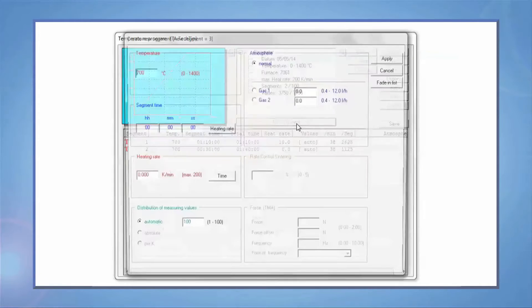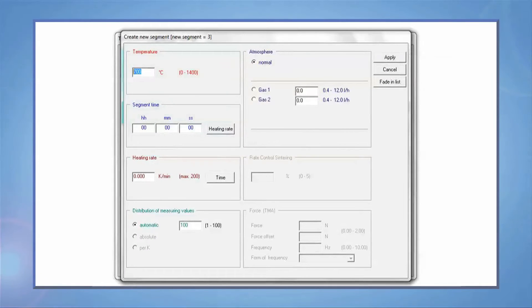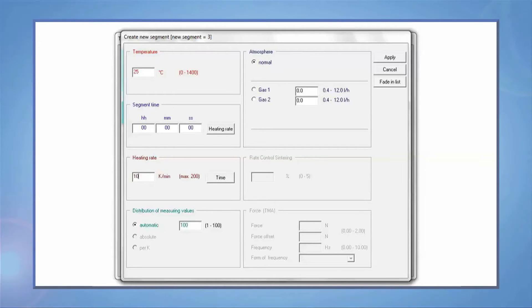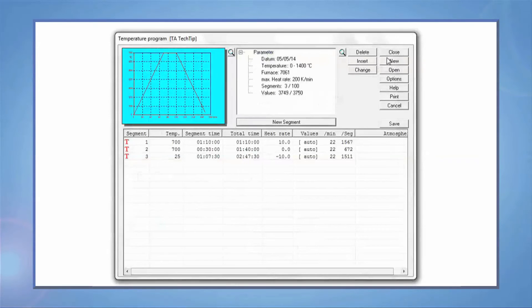Controlled cooling is also possible. Press New Segment, enter the cooling rate, and press Time. Remember that you need to have active cooling in order to control the cooling rate.